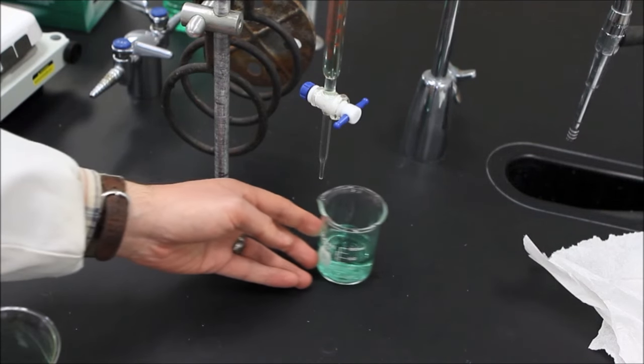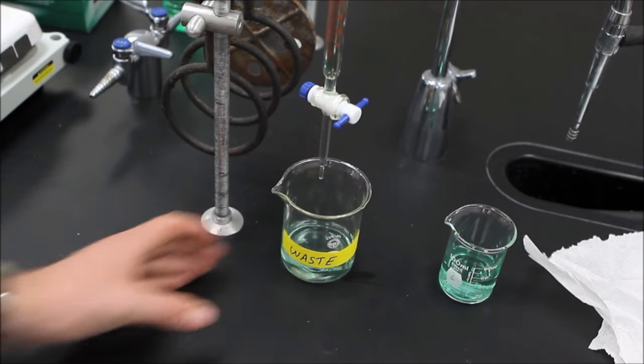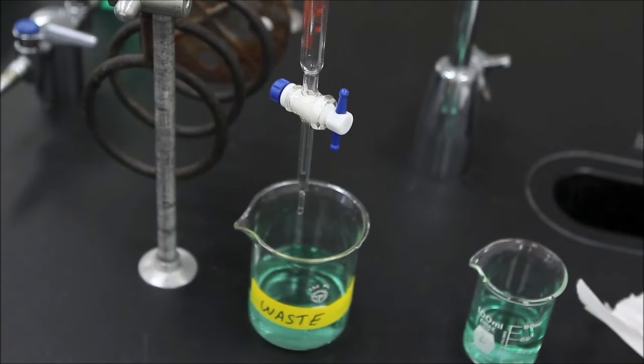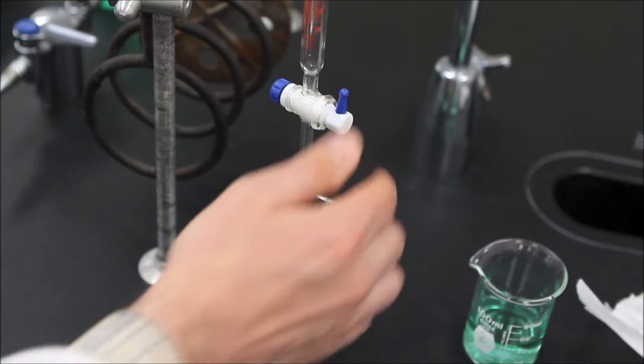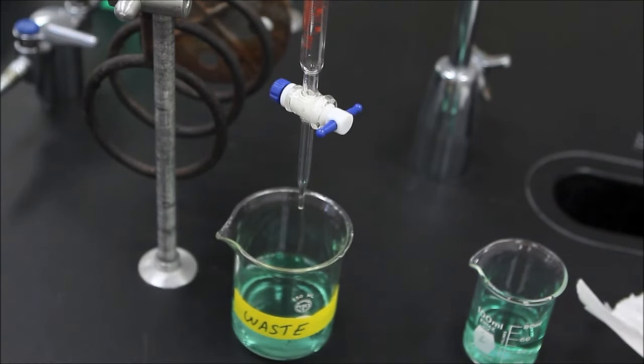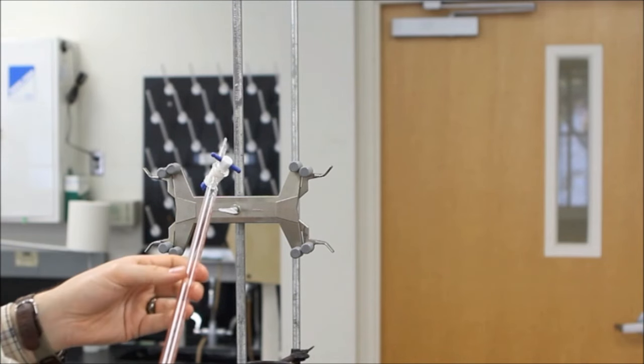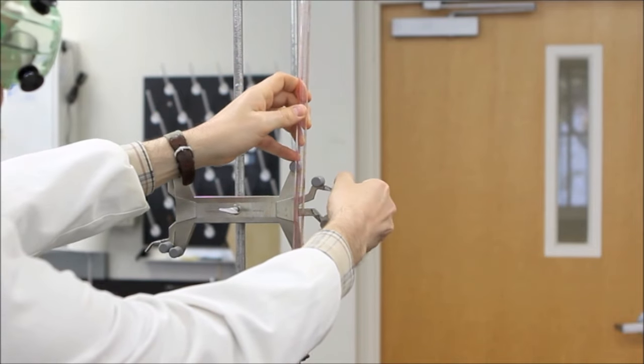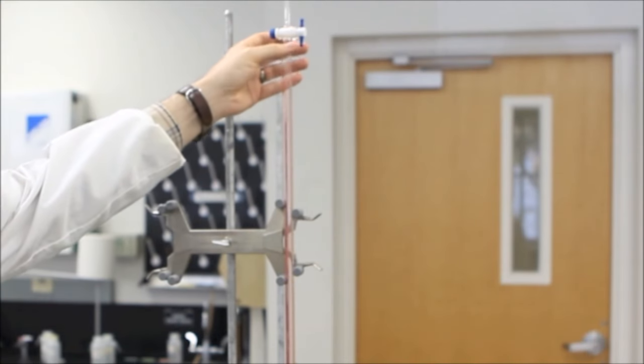When we are finished with the burette, first allow the solution to fully drain out of the burette, including the tip, and then clean it as before with two or three small volumes of deionized water. Finally, hang the clean burette upside down with the burette clamp, making sure that the stopcock is fully open to allow the burette to dry most efficiently. Thank you.